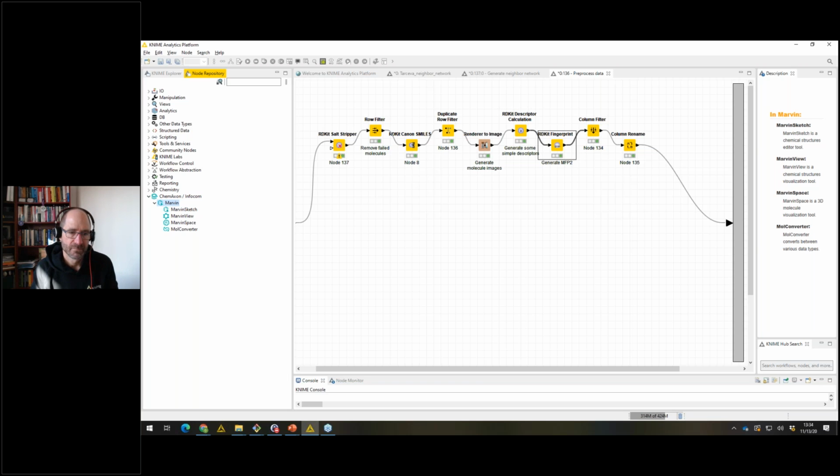Okay, great. I guess, sorry, if you do have one of these incorporated in your workflow and you don't have a license, what will happen is any of these nodes, or anything downstream from any of these nodes, will not work.